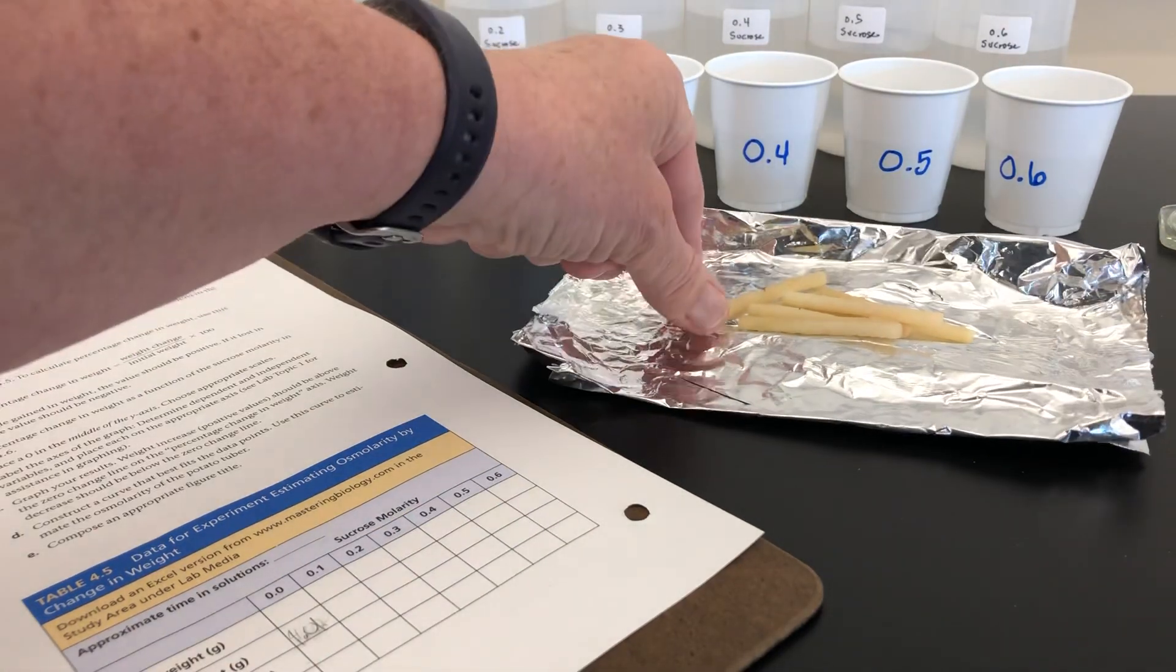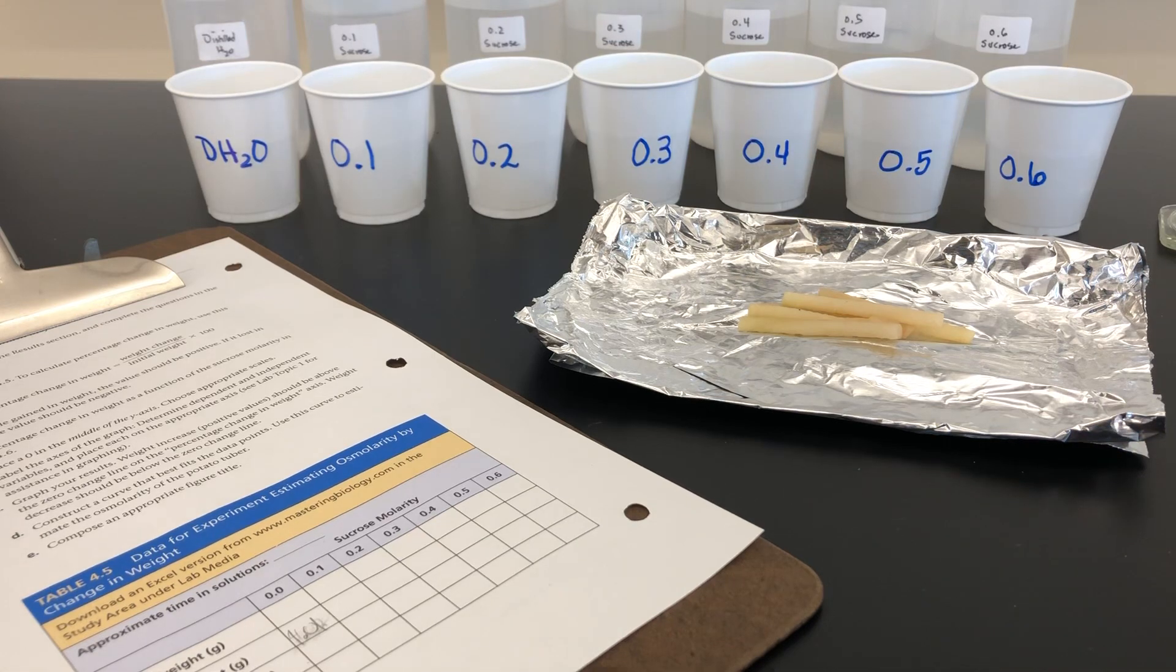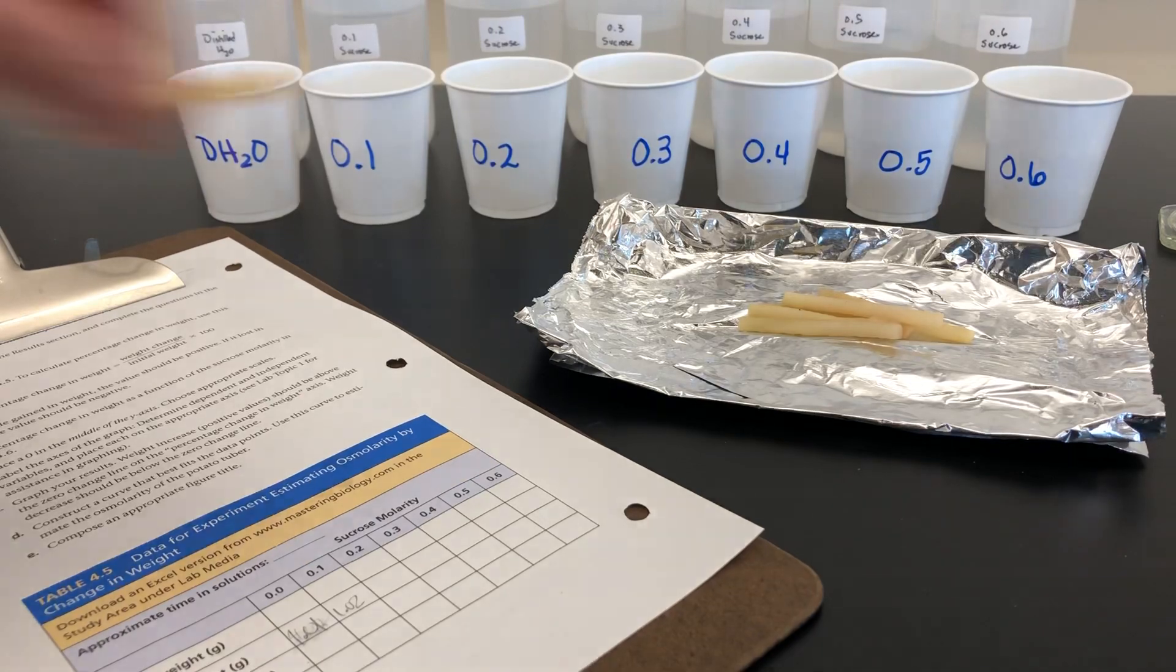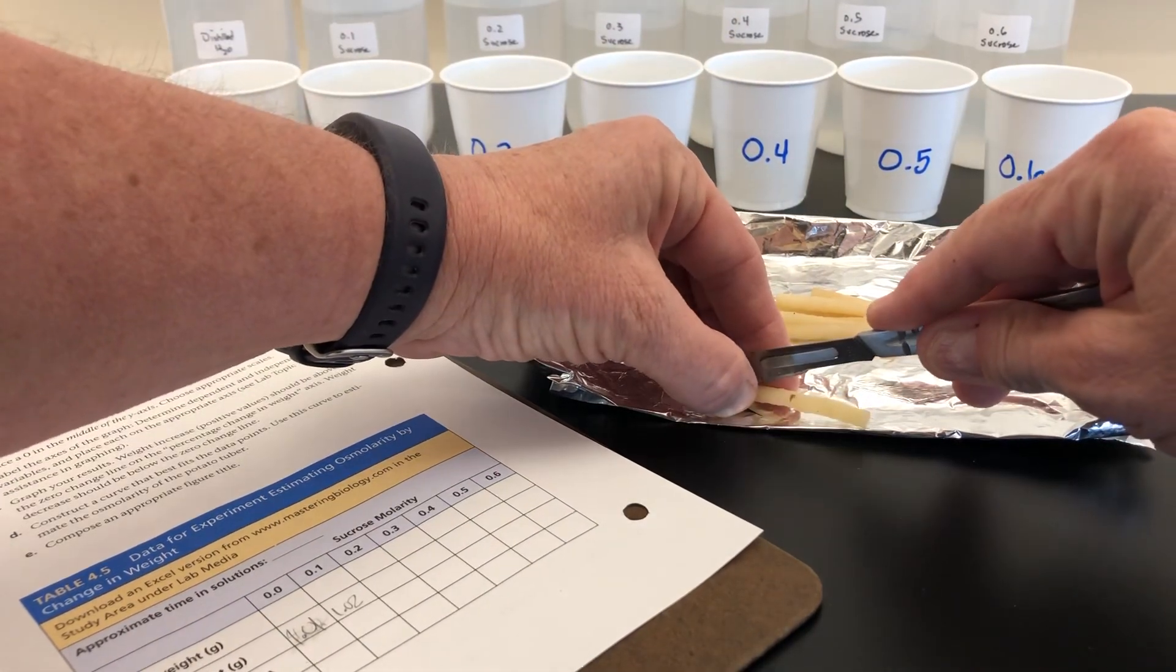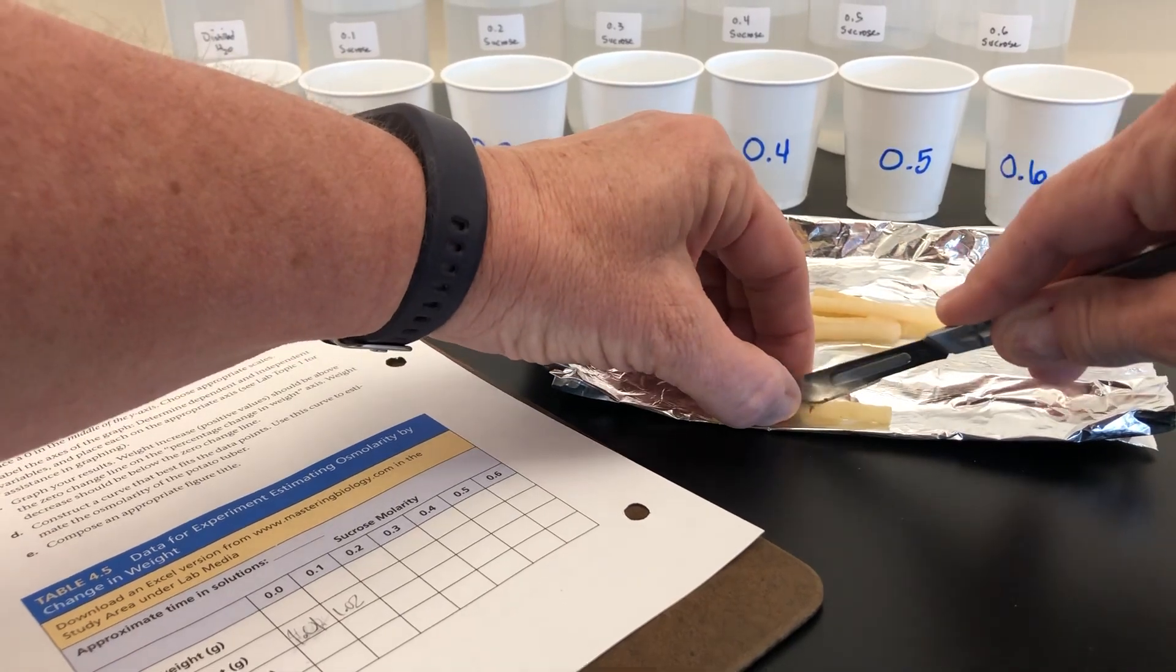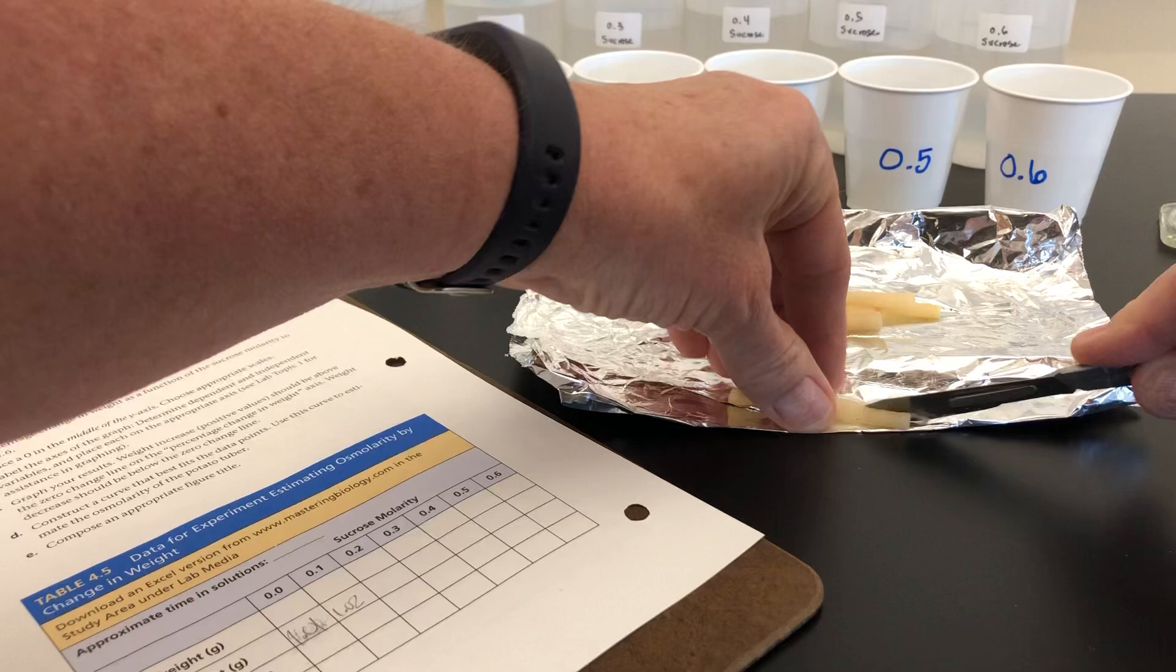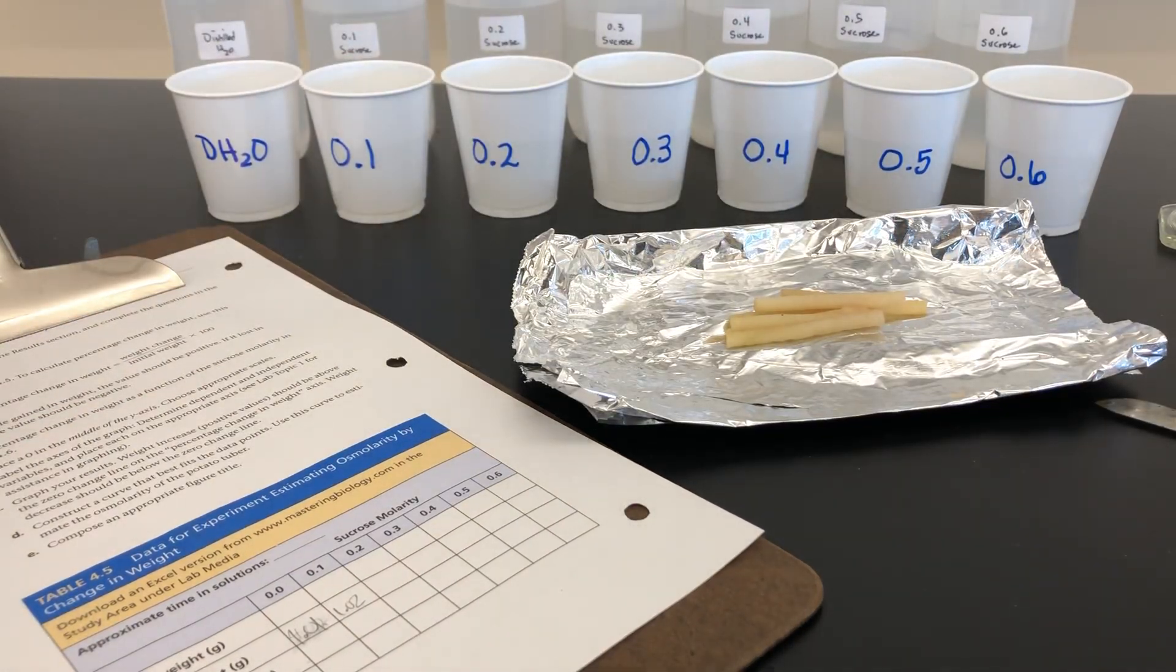The next cylinder weighs 1.02. Again, we'll cut it in half and put it in a sucrose solution of 0.1.